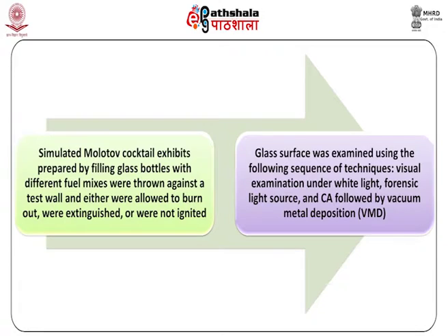The simulated Molotov cocktail exhibits, prepared by filling glass bottles with different fuel mixes, were thrown against a test wall and either were allowed to burn out, were extinguished, or were not ignited again. The glass surface was examined using a sequence of techniques, that is, first visual examination under white light, then the forensic light source, and then the cyanoacrylate fuming technique followed by the vacuum metal deposition, or VMD, method.